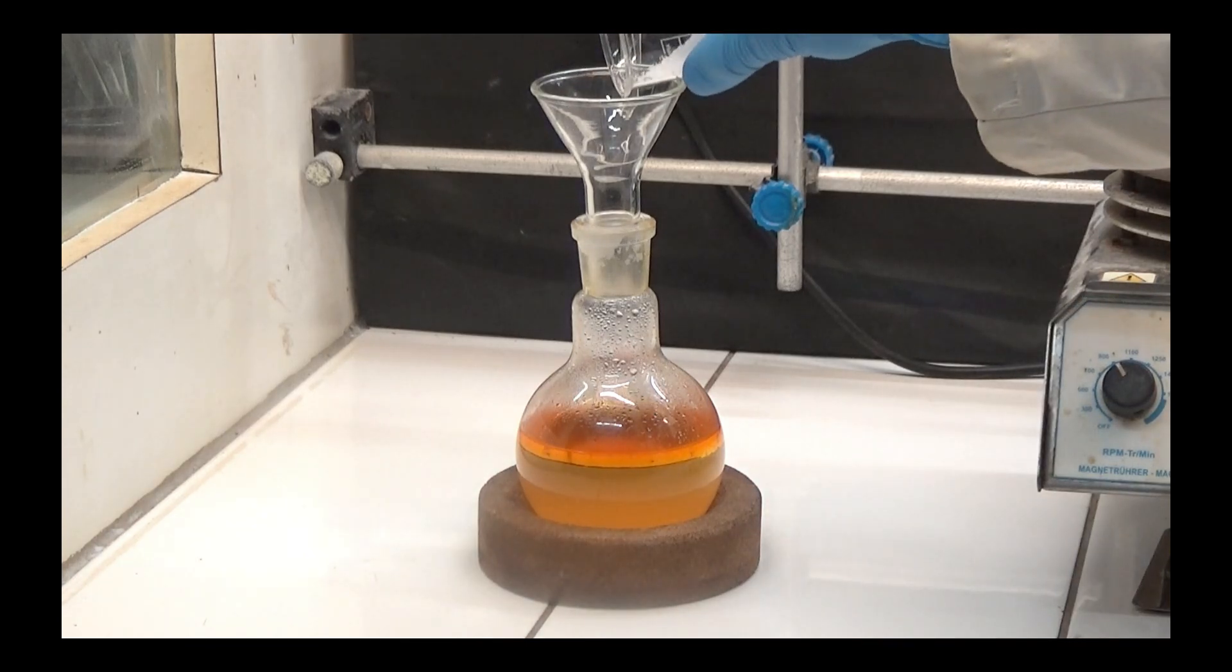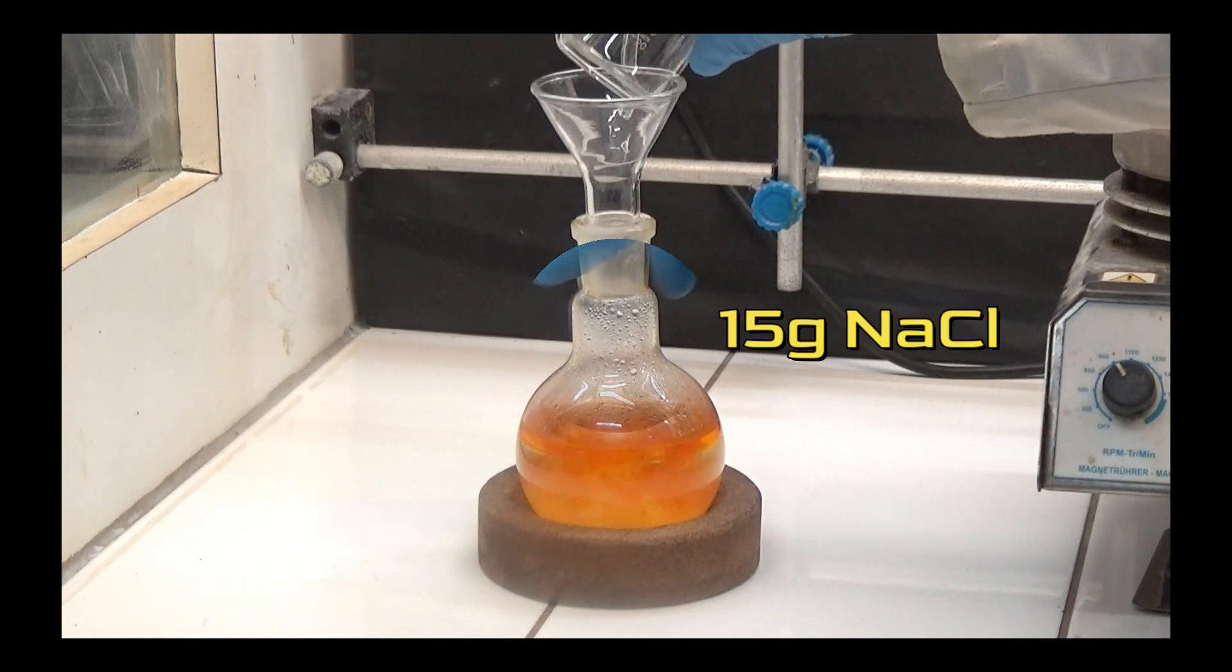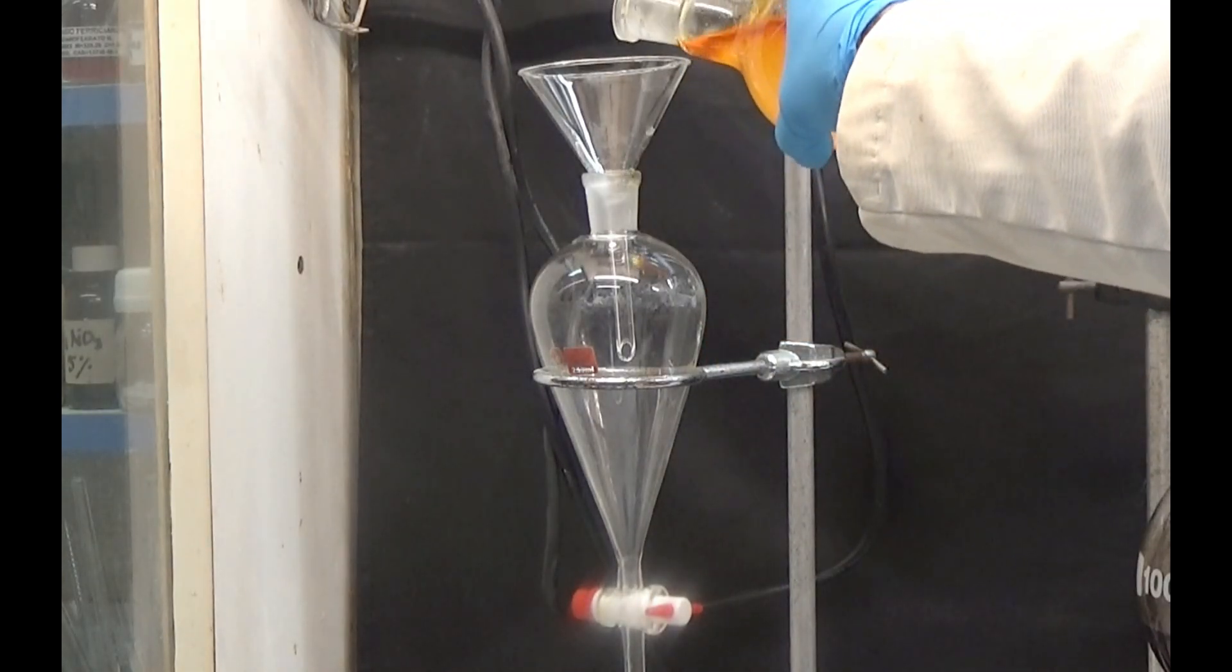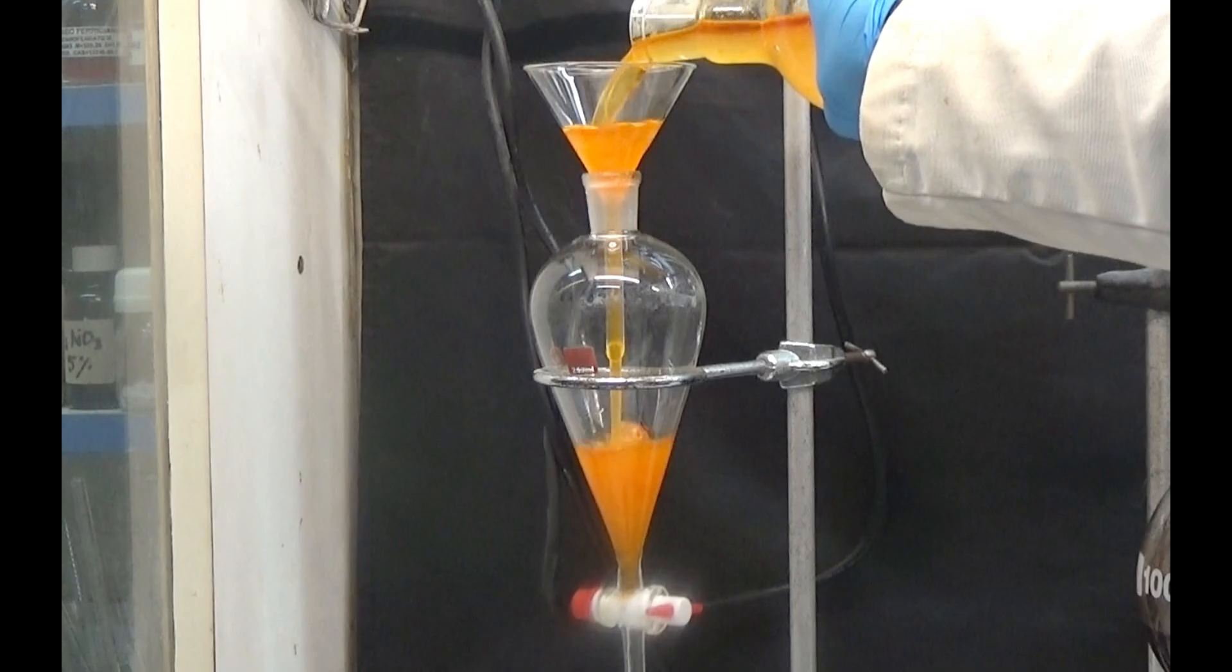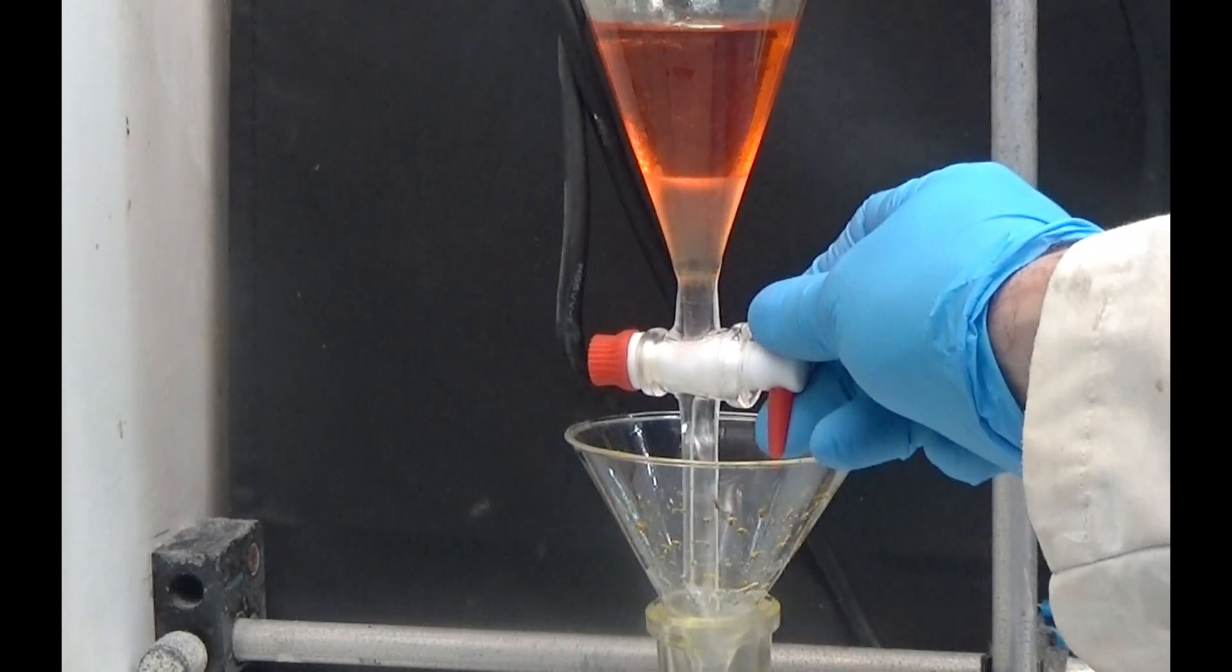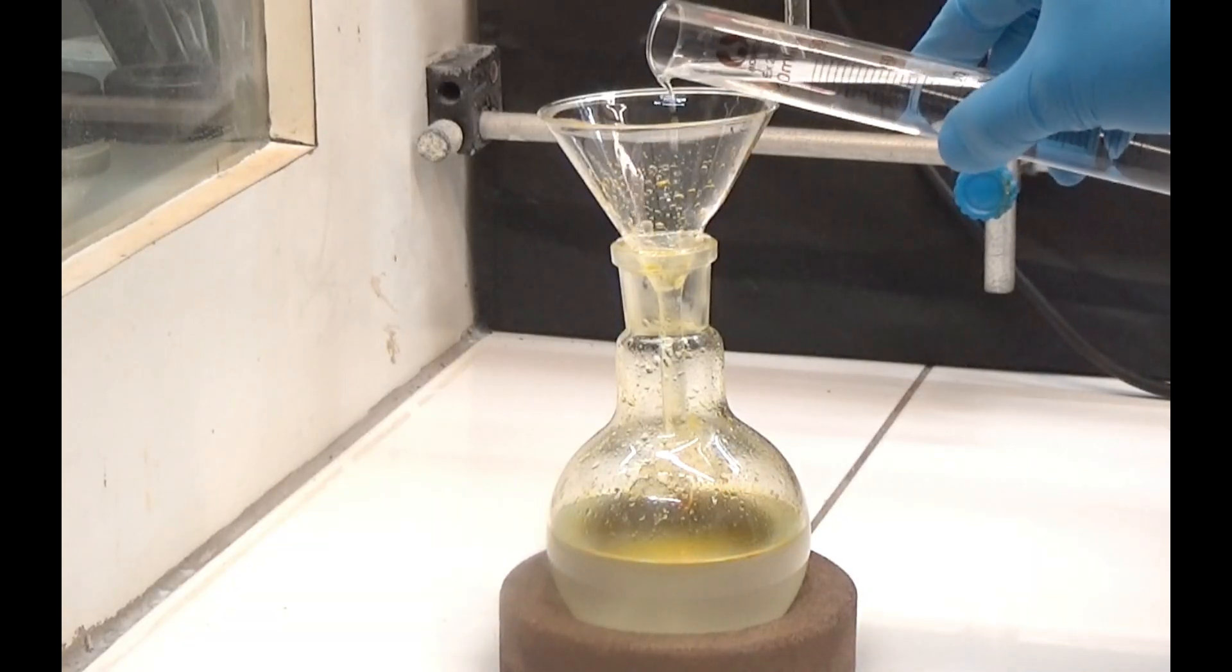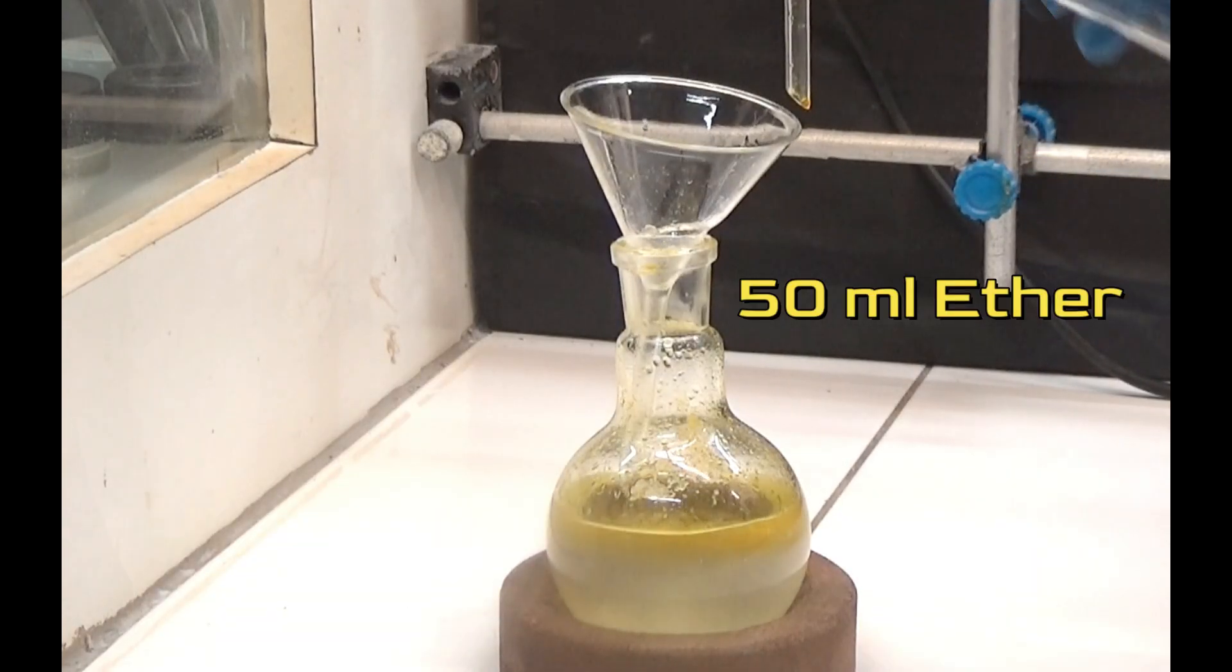Once the distillation is finished, we add 15 grams of sodium chloride to the distilled mixture and stir it to dissolve it. Use a separating funnel to separate the aqueous phase from the organic phase. Wash the aqueous phase with 50 milliliters of ether.